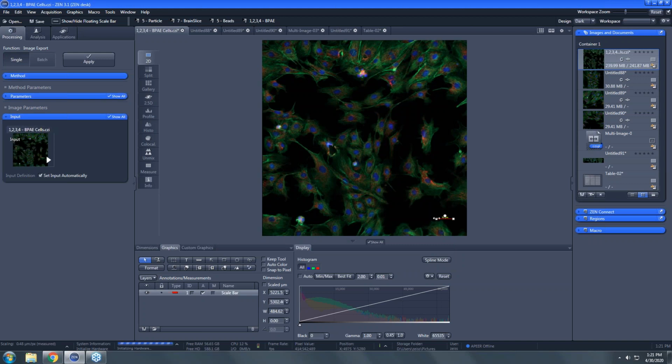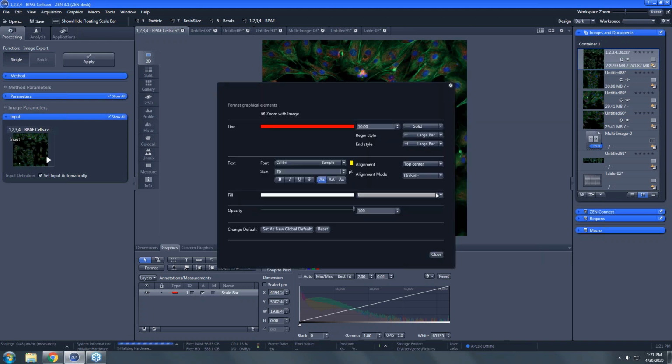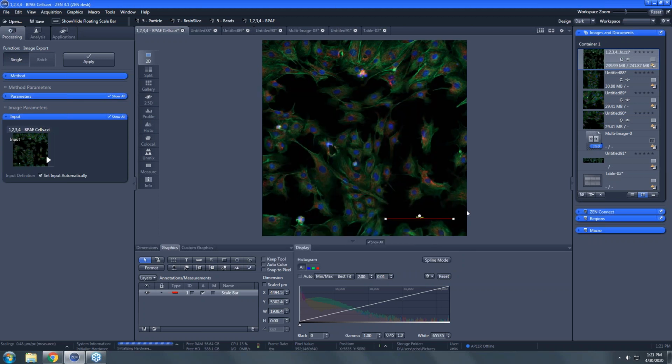But really, if you look at the agenda, which we've handed out and is available in the handouts on your webinar toolbar, all those functionalities that we're showing are really Zen Lite. So the intention of this was to tell people functionality that they have currently and are going to always have, that's available to Zen Lite.